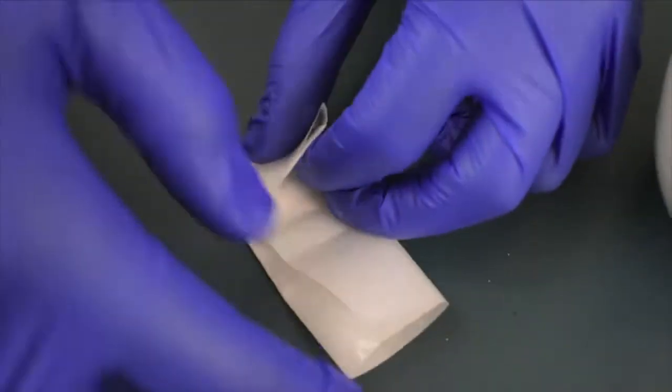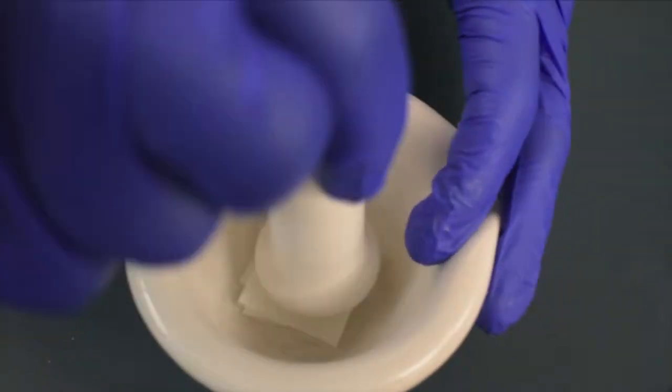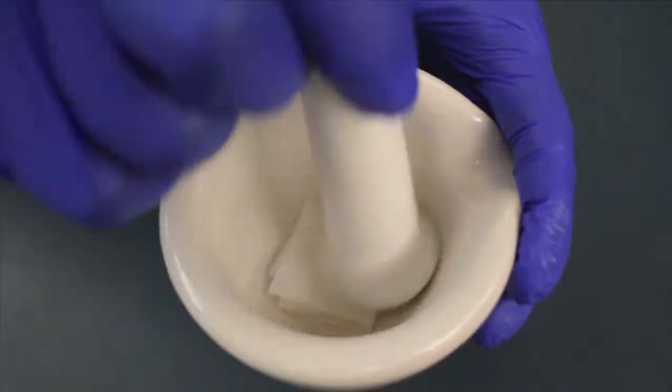Place the required amount of dry sample onto your weighing paper. Fold and fully enclose the paper and place it into the mortar and pestle. Grind the dry sample vigorously into a fine powder.